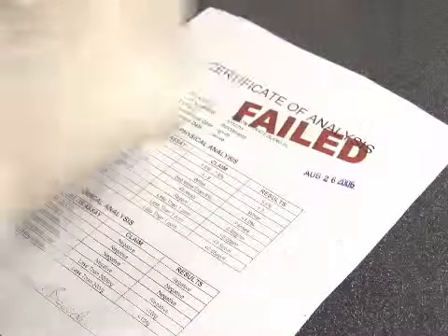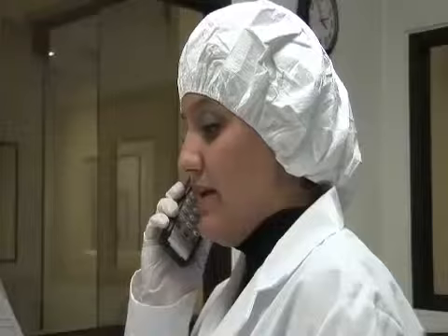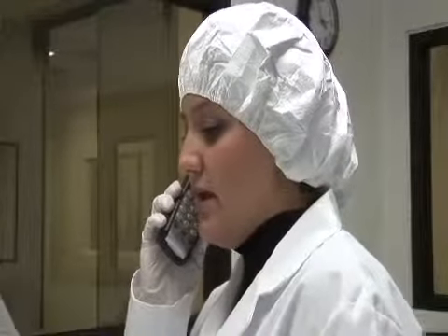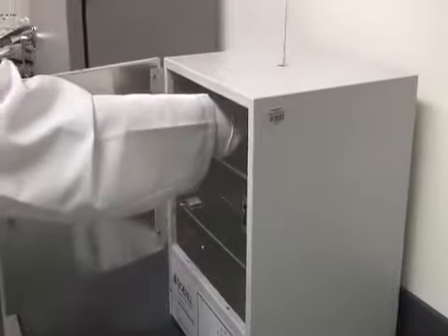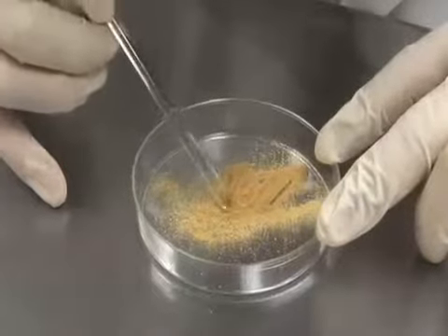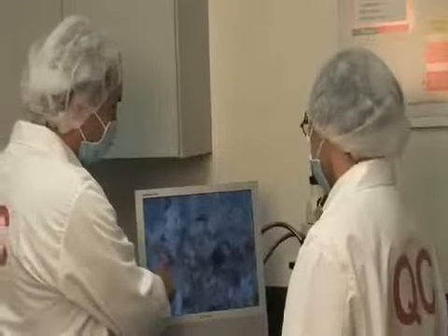If a powder fails this analysis, we return it to the supplier, but our senior QC director then also investigates why that supplier failed in its quality control. The laboratory director analyzes the sample to see if it's free from harmful bacteria. If the powder fails this test, it goes for sterilization and then gets retested. The laboratory director also examines the powder to make sure that it is not contaminated with dirt or other particles.